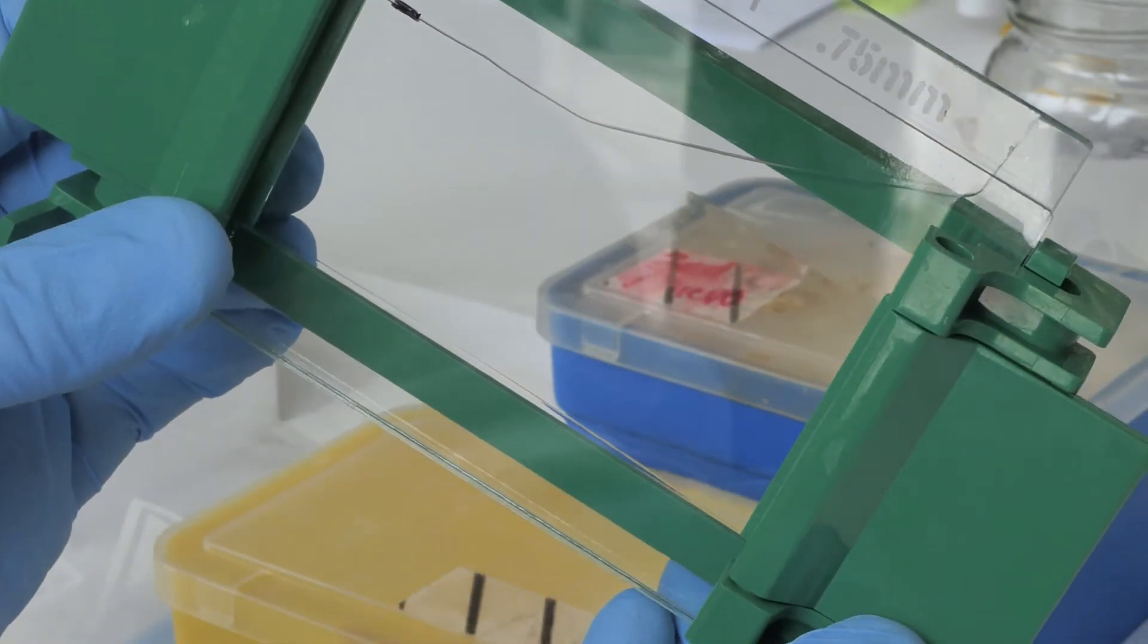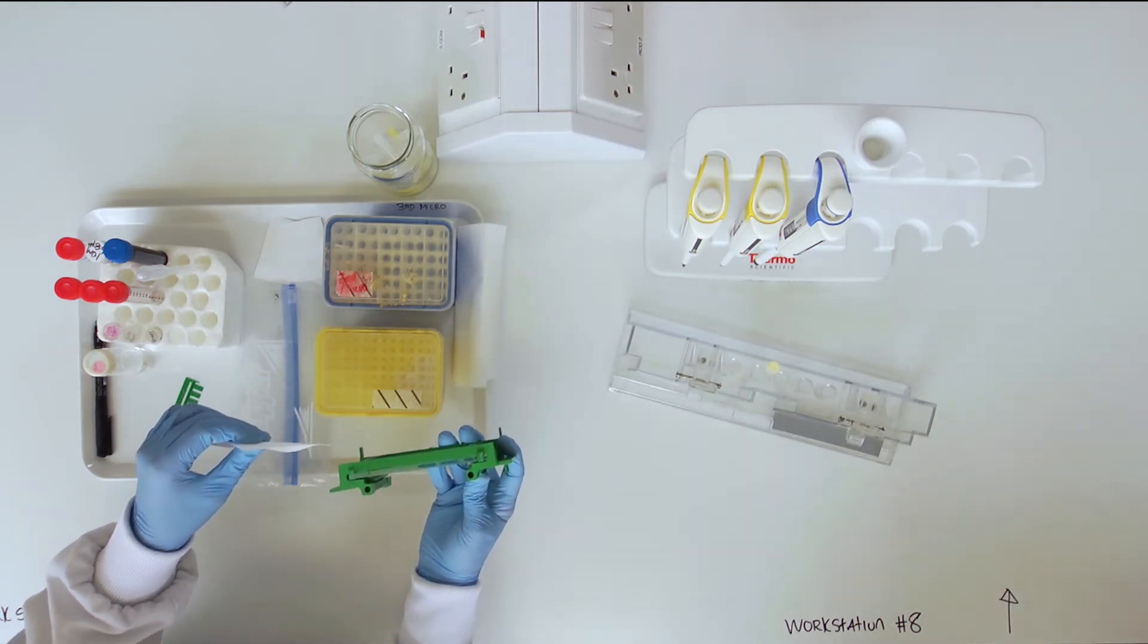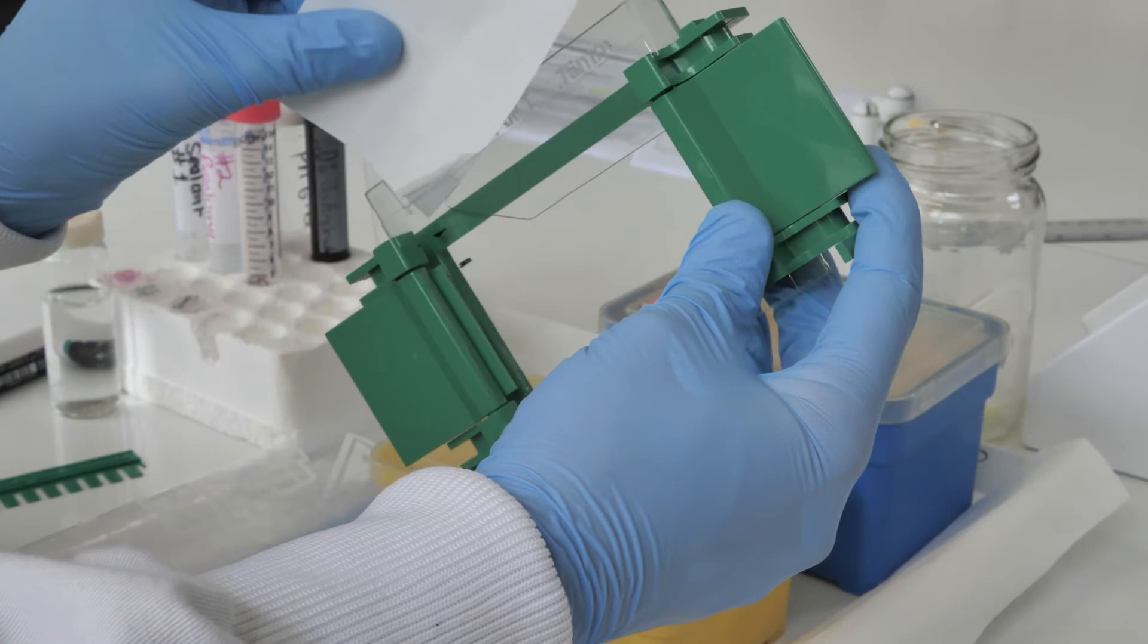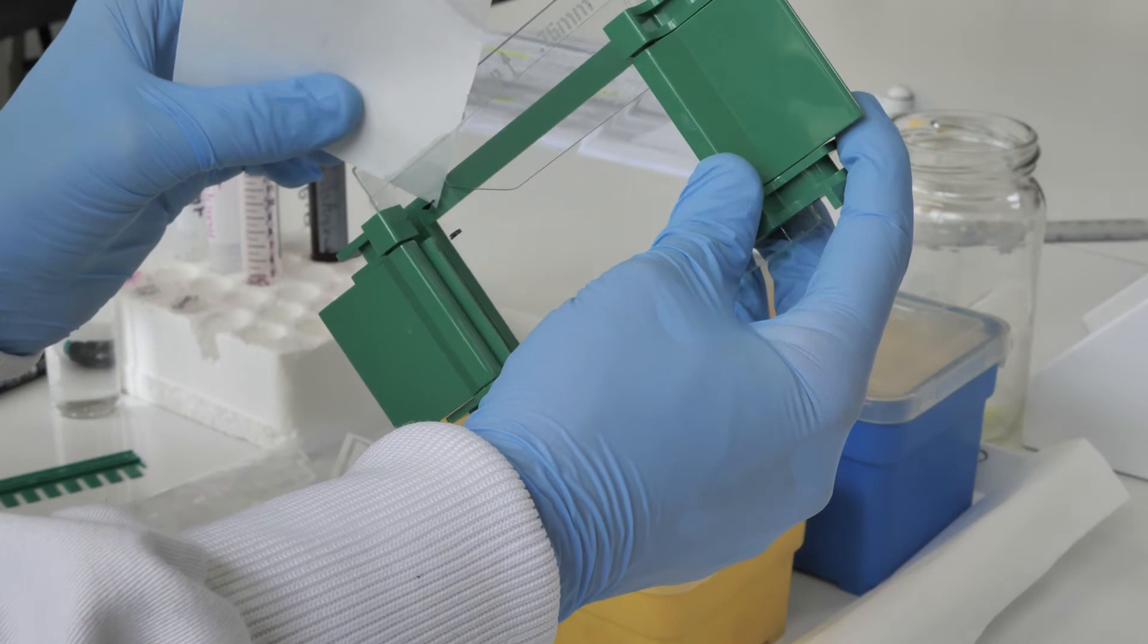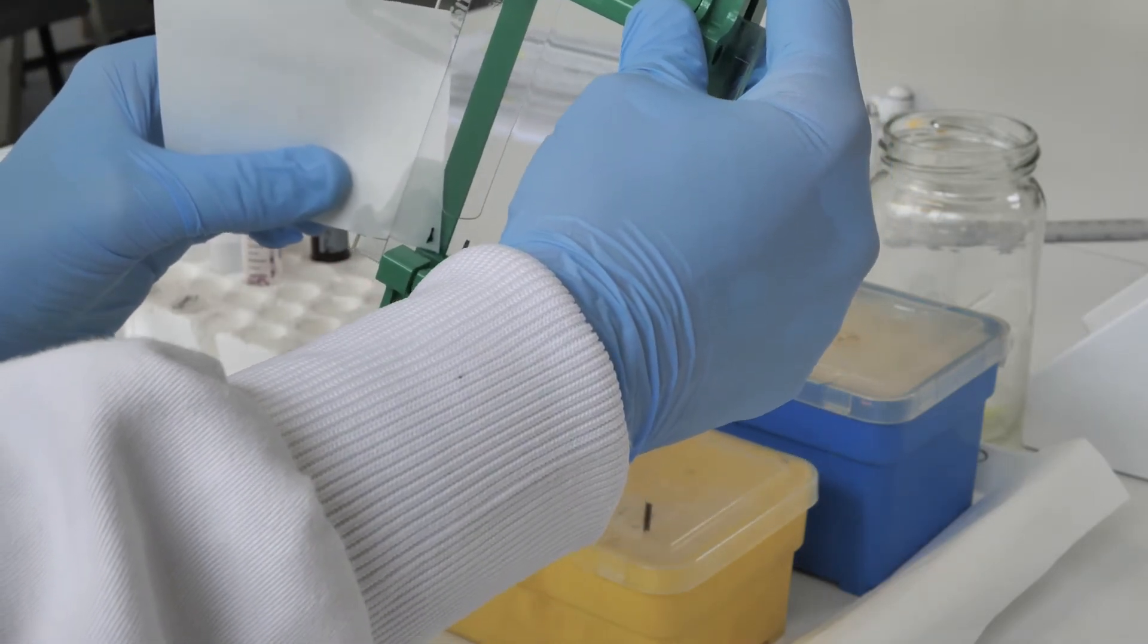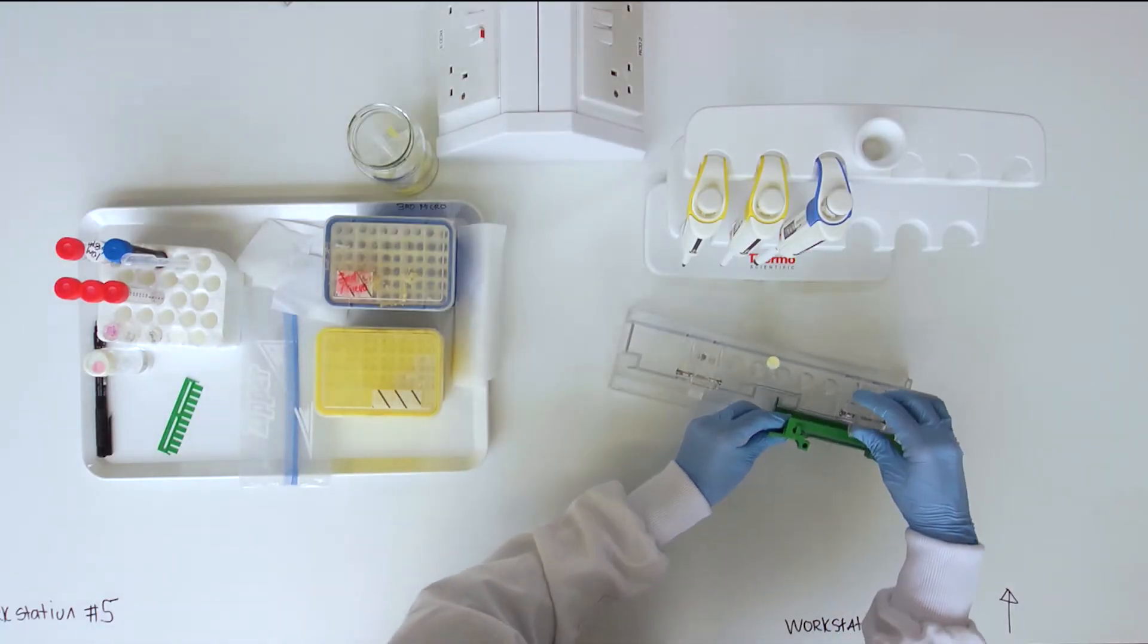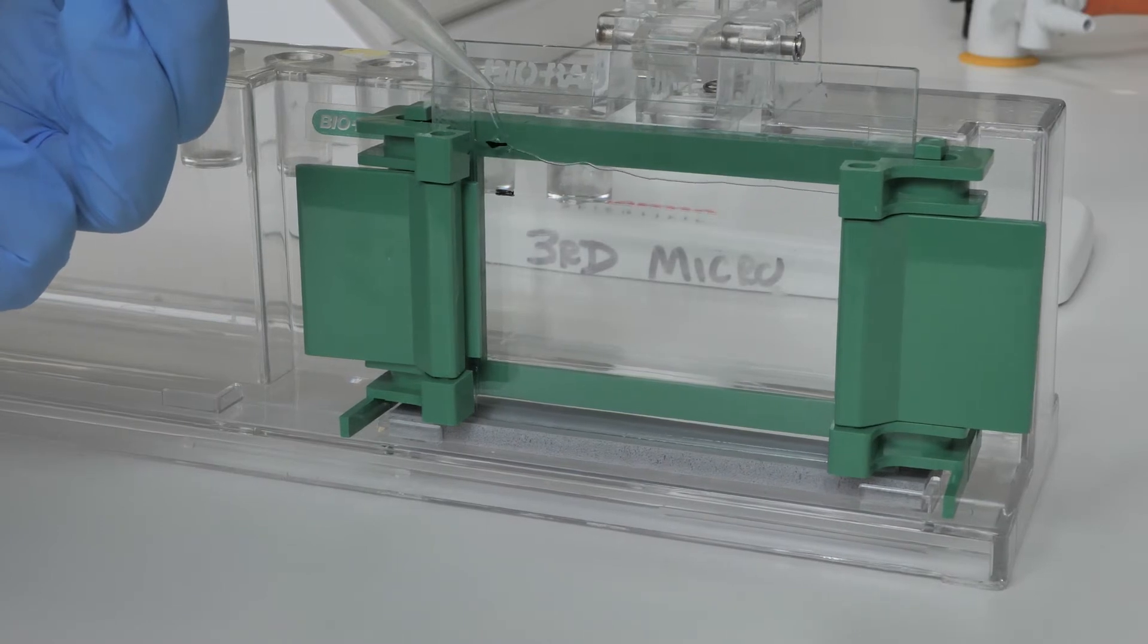When the resolving gel has polymerized, pour out the overlaid water. You can use filter paper to remove the last of it. Pipette the gel solution into the glass sandwich until it reaches the top of the plates.